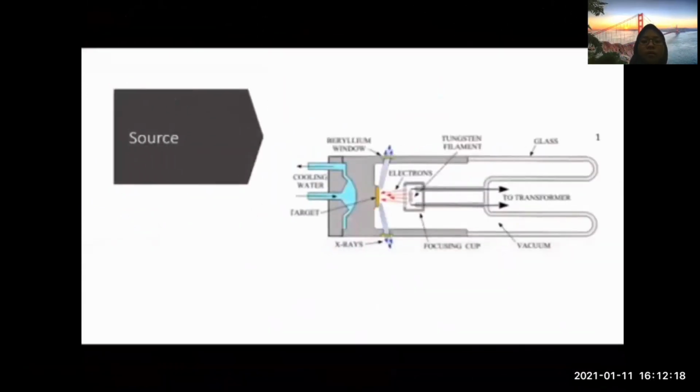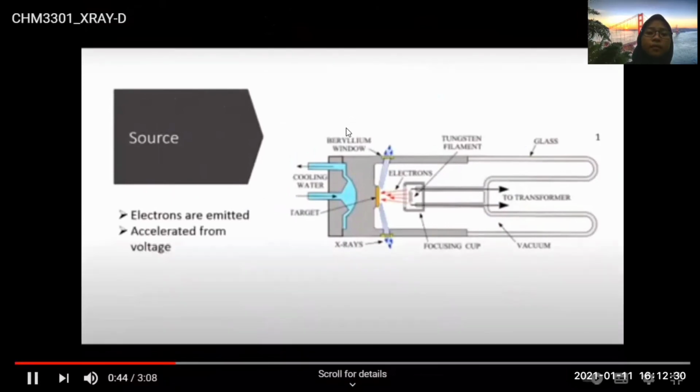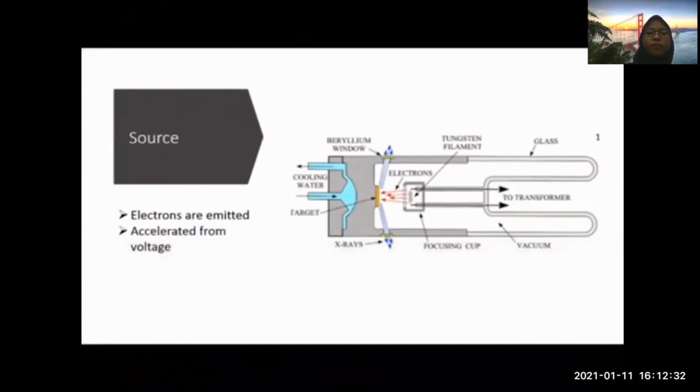The X-ray tube, also known as the source, is what produces the X-rays. This works by having a tungsten filament emit electrons. The electrons receive an applied voltage, which makes an electric field and accelerates the electrons, as well as directs them towards the X-ray target material. Electrons bombard the target atomic structure, causing secondary electrons to be kicked out of the electron shells. Holes in the electron shell caused by secondary electrons being expelled leave it in an unstable state. Electrons from higher energies will drop down to fill the space, releasing energy in the form of X-rays.